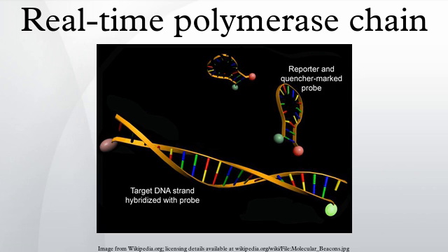Modeling. Unlike endpoint PCR, real-time PCR allows quantification of the desired product at any point in the amplification process by measuring fluorescence. A commonly employed method of DNA quantification by quantitative PCR relies on plotting fluorescence against the number of cycles on a logarithmic scale. A threshold for detection of DNA-based fluorescence is set slightly above background. The number of cycles at which the fluorescence exceeds the threshold is called the threshold cycle or, according to the MIQE guidelines, quantification cycle. During the exponential amplification phase, the quantity of the target DNA template doubles every cycle.